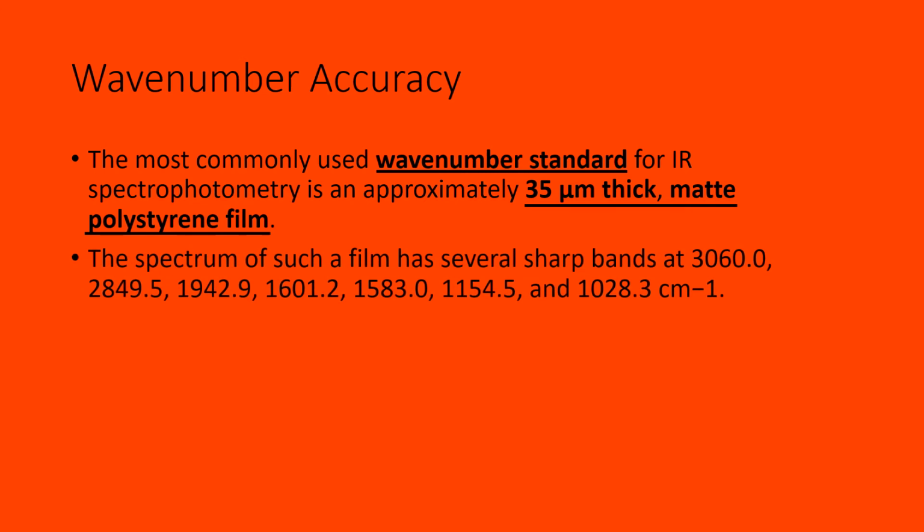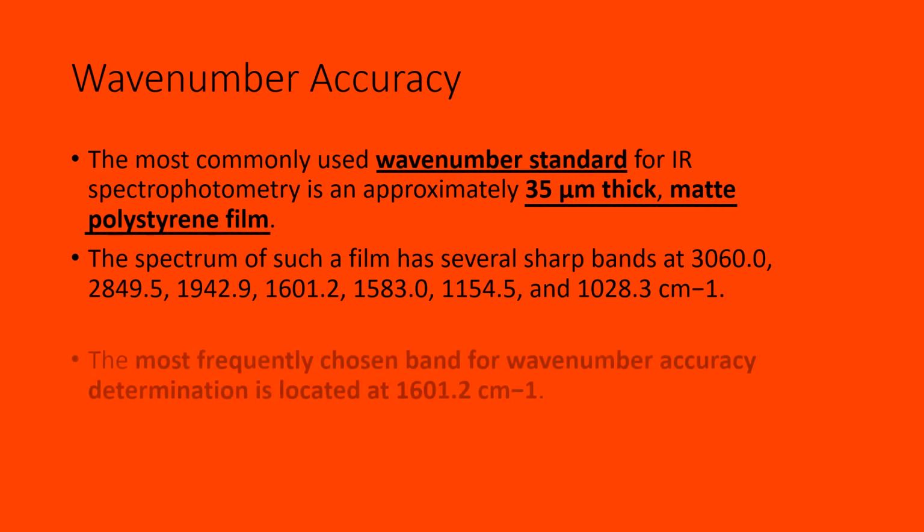The spectrum of such a film has several sharp bands at 3060 cm⁻¹, 2849.5 cm⁻¹, 1942.9 cm⁻¹, 1601.2 cm⁻¹, 1583 cm⁻¹, 1154.5 cm⁻¹ and 1028.3 cm⁻¹.